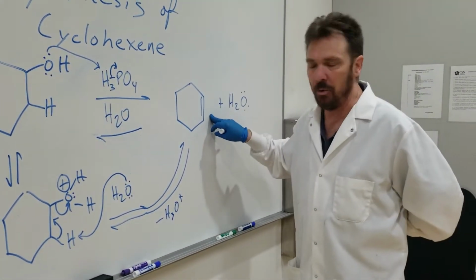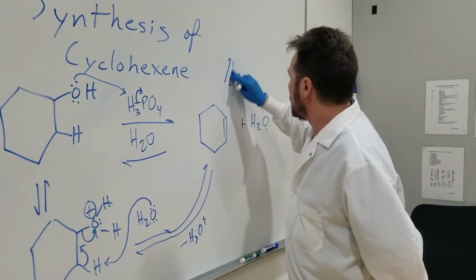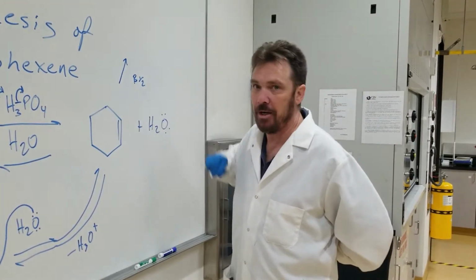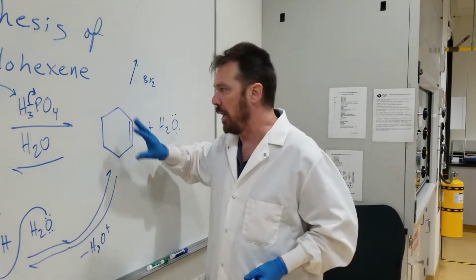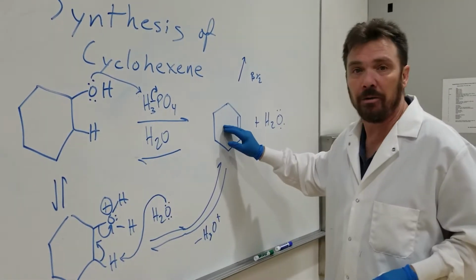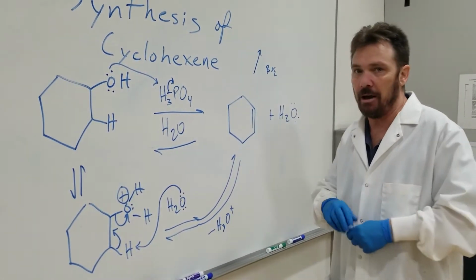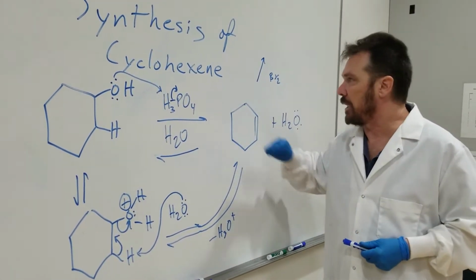We're not going to do it today, but we could do a bromine test on here. That's just a reaction arrow, and the bromine test. You can figure out what the product is there and put that in your lab report as the write-up of what you would expect from this. We will be taking an IR of our product as well as our starting material, and you can compare the two. Look for the features that you would expect here, and look for any possible impurities that might show up in the IR of our final product. Okay, so let's get to work and let's make some cyclohexene.